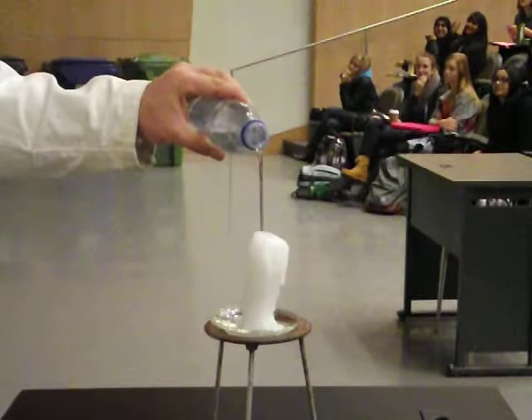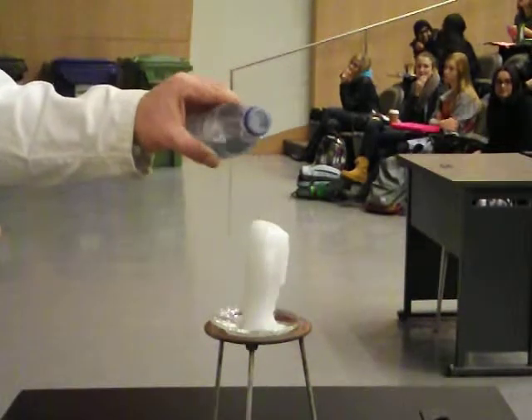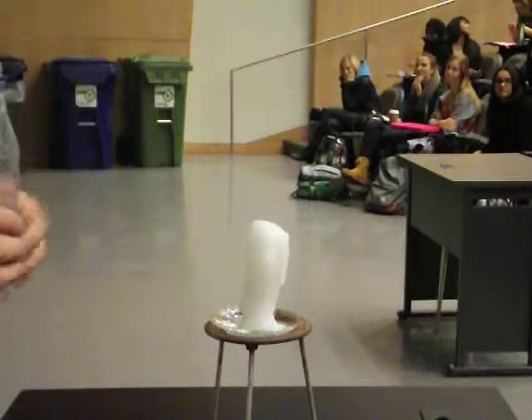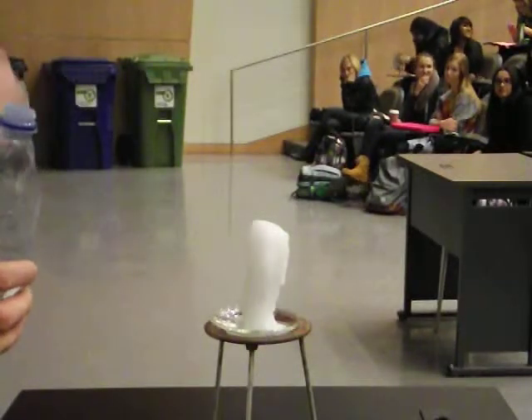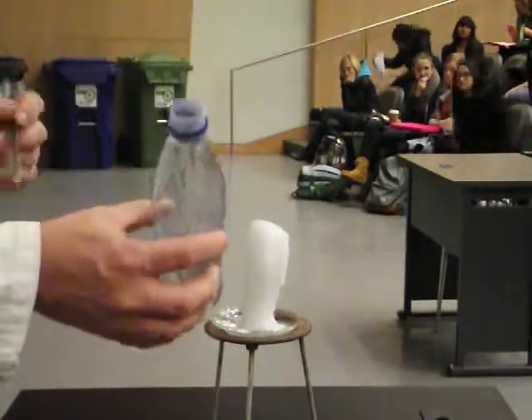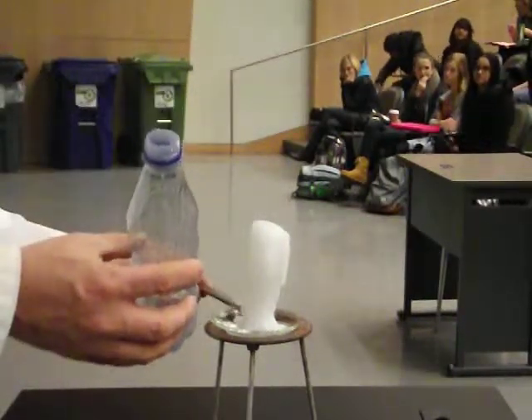As I pour it out, it's going from a liquid to a solid almost instantly. It's not wax — it's actually a supersaturated solution.